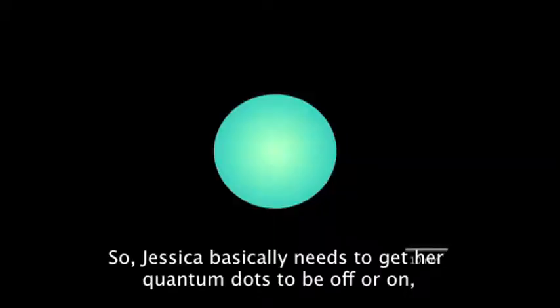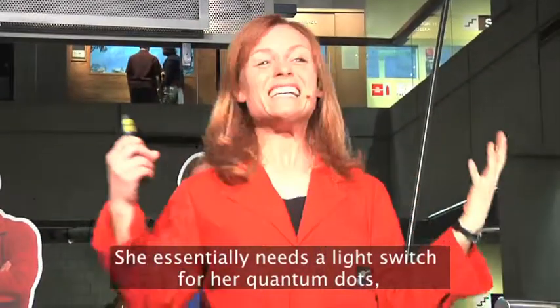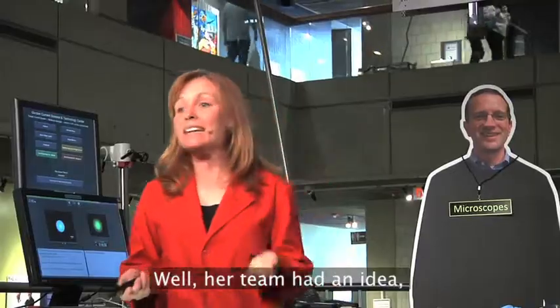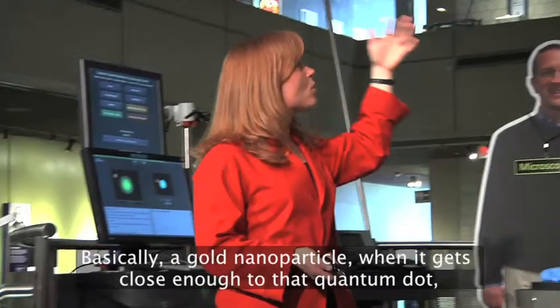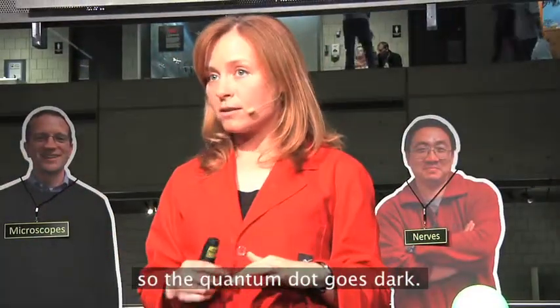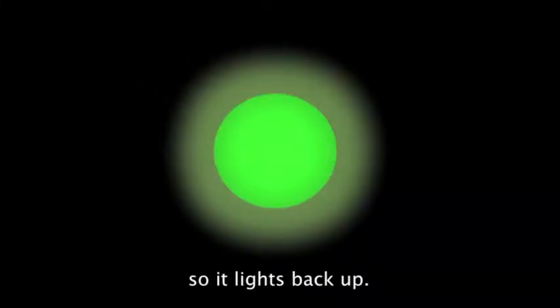So Jessica basically needs to get her quantum dots to be off or on command. She essentially needs a light switch for her quantum dots, and they don't come with light switches. So what's she gonna do? Well, her team had an idea about how to use a tiny gold nanoparticle to control the quantum dot. Basically, a gold nanoparticle, when it gets close enough to that quantum dot, absorbs the energy that would otherwise be given off as light, so the quantum dot goes dark. When that gold nanoparticle moves away, the energy can again be released as light, so it lights back up.